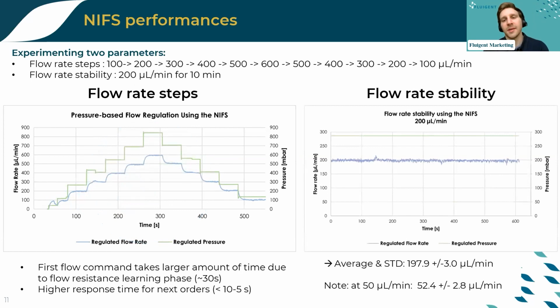So regarding flow rate stability, that's a very straightforward experiment. We just put 200 microliters per minute for more than 10 minutes, and we just measure the average and the standard deviations, which are in line with our performance and our specifications.